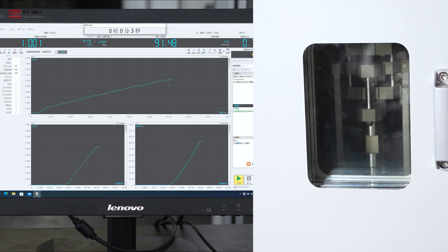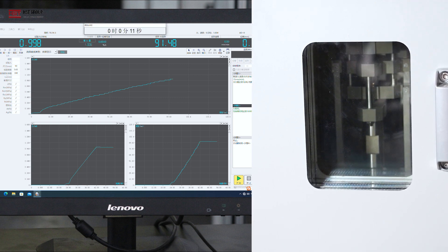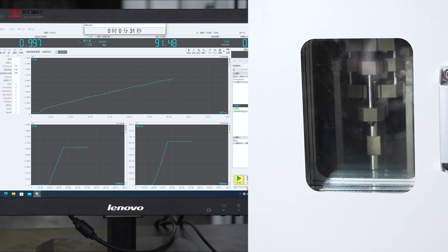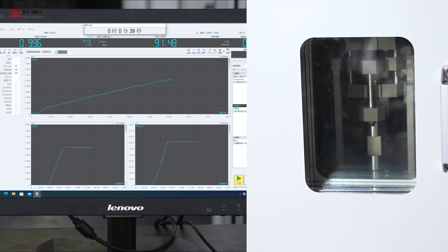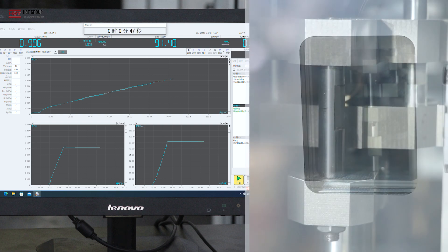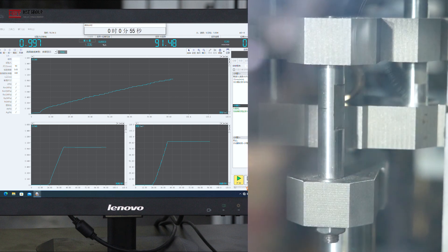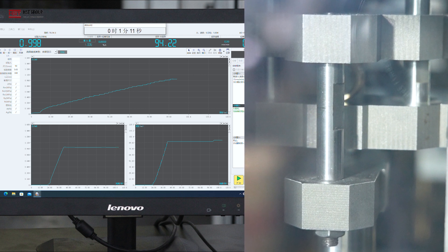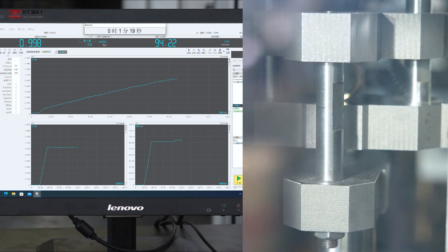Open machine and begin the test run. Operator commands are issued to guide the machine movement during the test process.